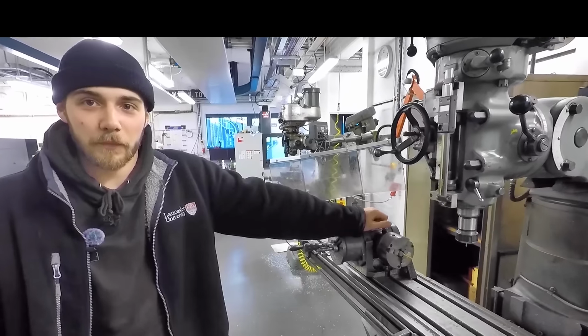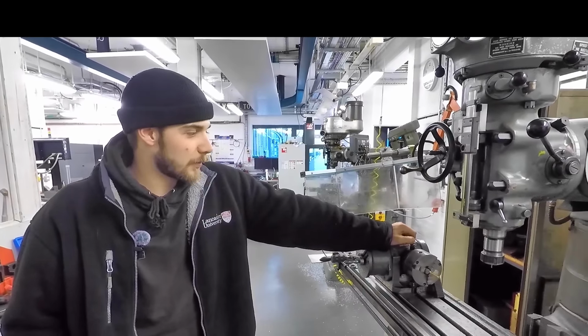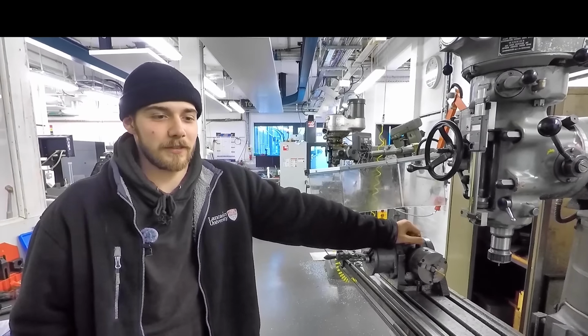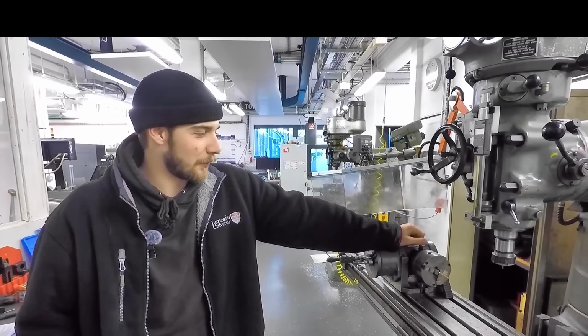Brilliant. How long did it take to cut that piece, both sides, in the end? Roughly about 20 minutes total cutting time. So it was reasonably quick to do, but getting it correct took a few days. A few days of working to get it going well.